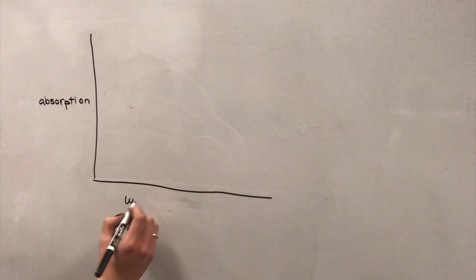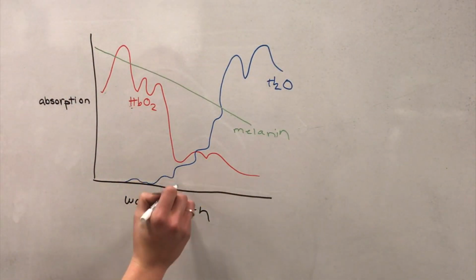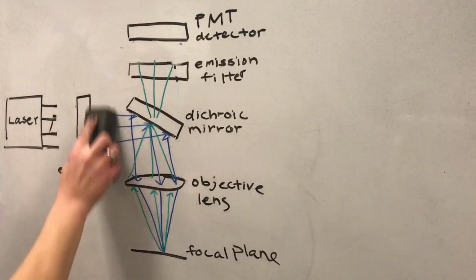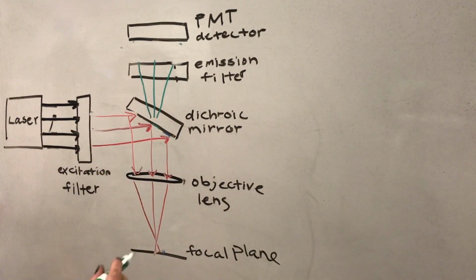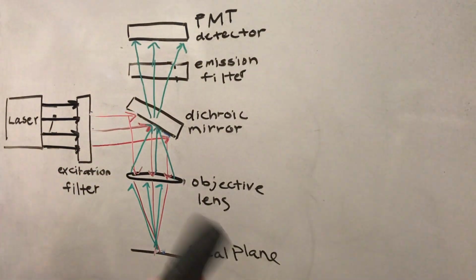Using longer wavelengths of light, specifically infrared light, is beneficial because many biological molecules have much lower absorption of light at those wavelengths. In TPM, a pulsed output laser, typically a titanium-doped sapphire laser, is used. When two photons simultaneously interact with a fluorescent molecule and excite it, a photon is emitted from the sample. The emitted photon then travels to the PMTs.